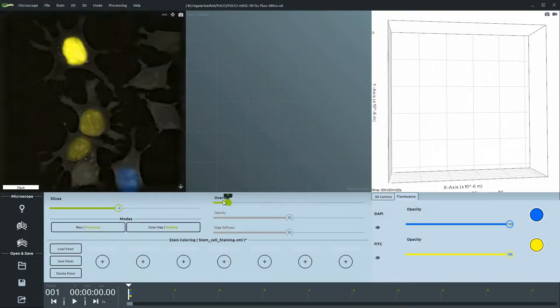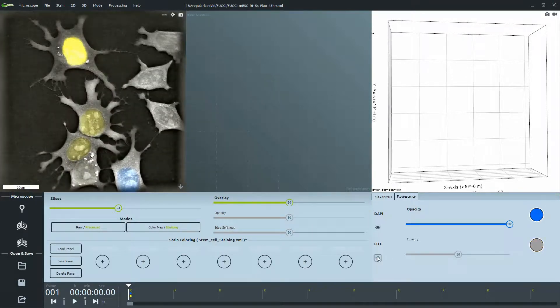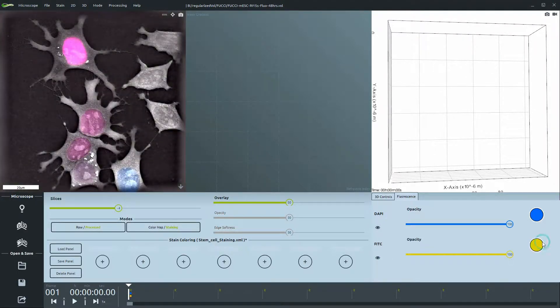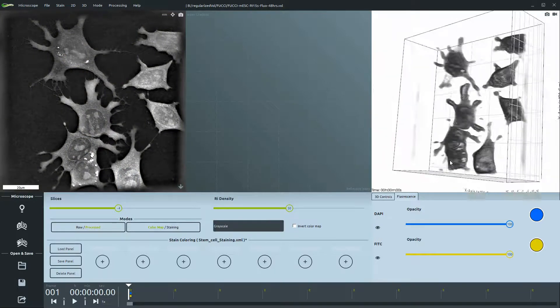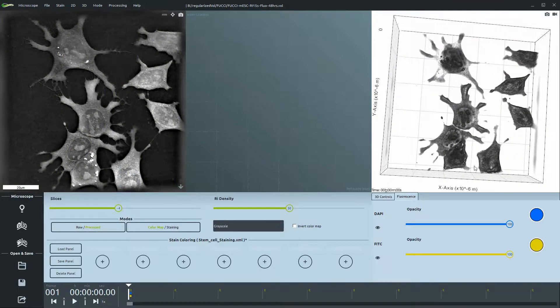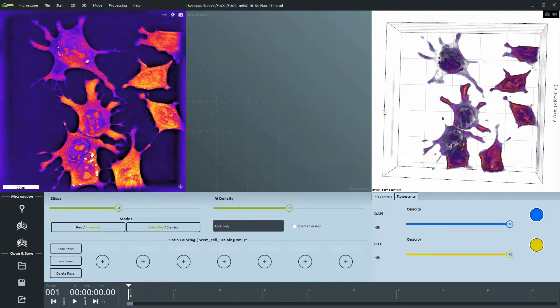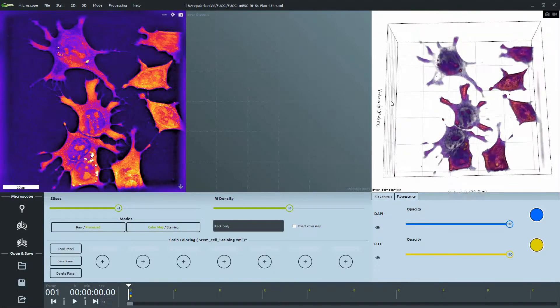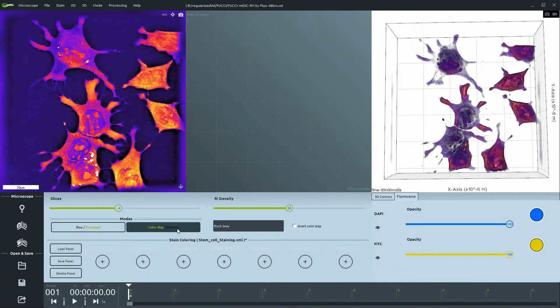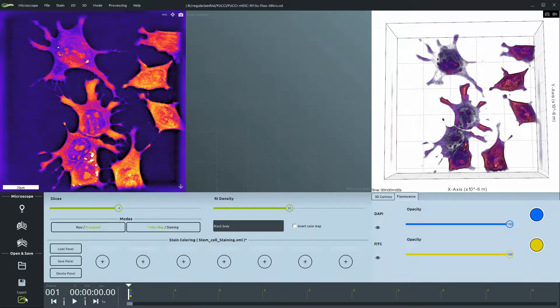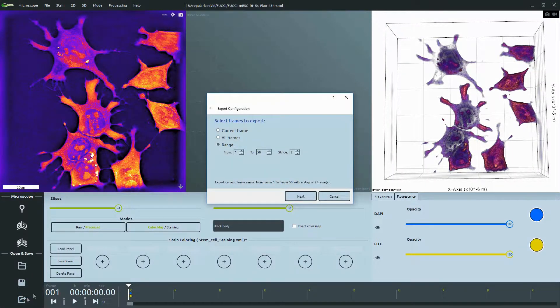Every data or visualization that you can see or manipulate within Steve can be exported. This video will guide you through the export options in detail. When clicking on the export icon, a dialog box opens up to guide you through the steps.